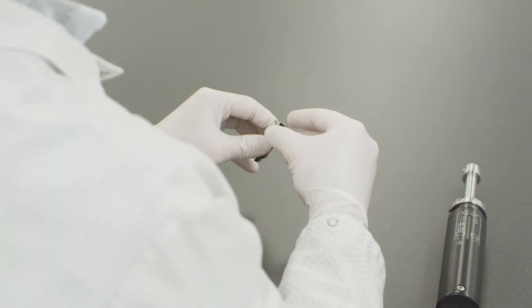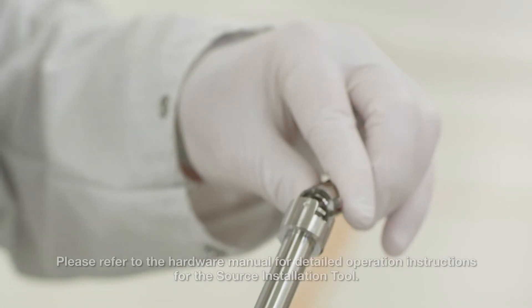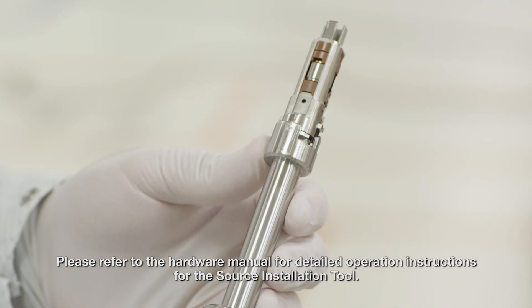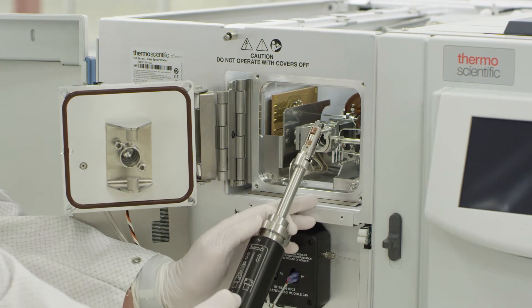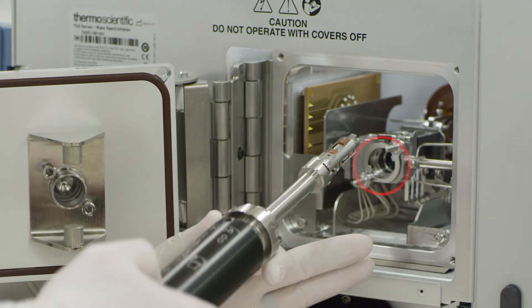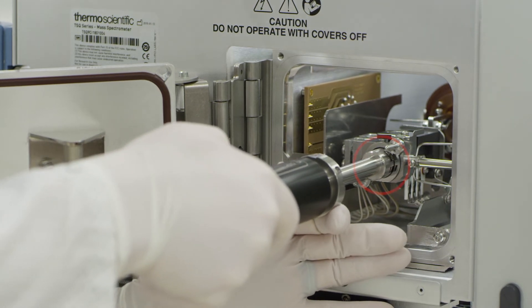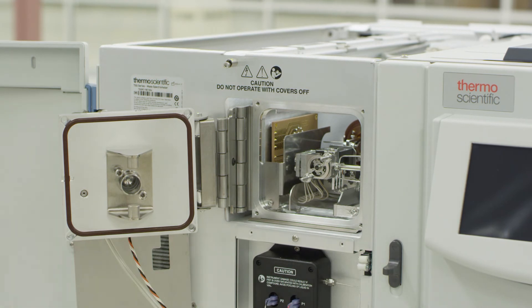Put the AEI source onto the source installation tool as you normally would, by pushing down and turning counter-clockwise. Very carefully insert the AEI source. There should not be a great deal of resistance. If there is resistance, stop and remove the source and check for obstruction. Turn the installation tool clockwise to seat the source cartridge and release it from the installation tool.